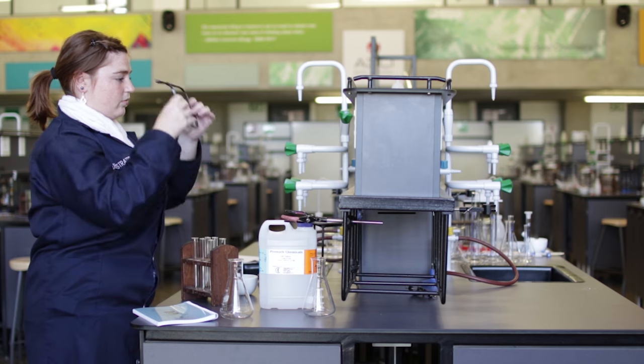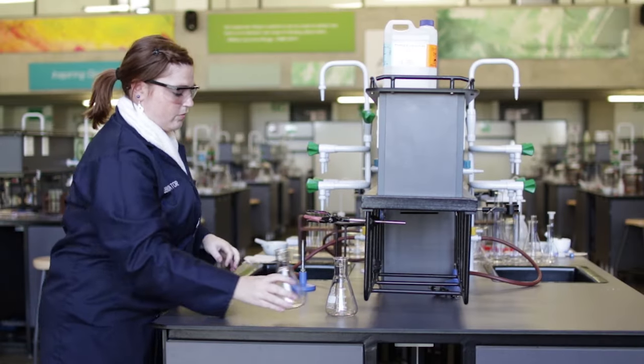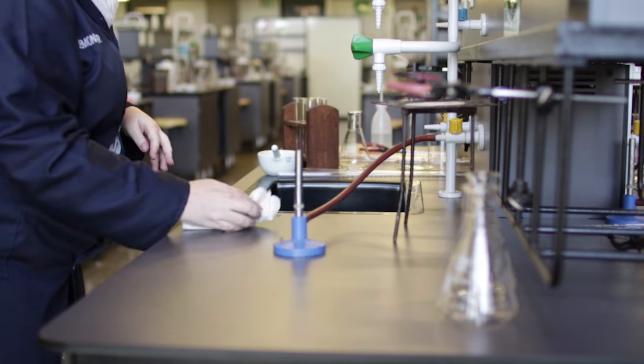Check that the area around your Bunsen burner on your bench is clear and that there are no flammable substances such as alcohols anywhere near your bench.